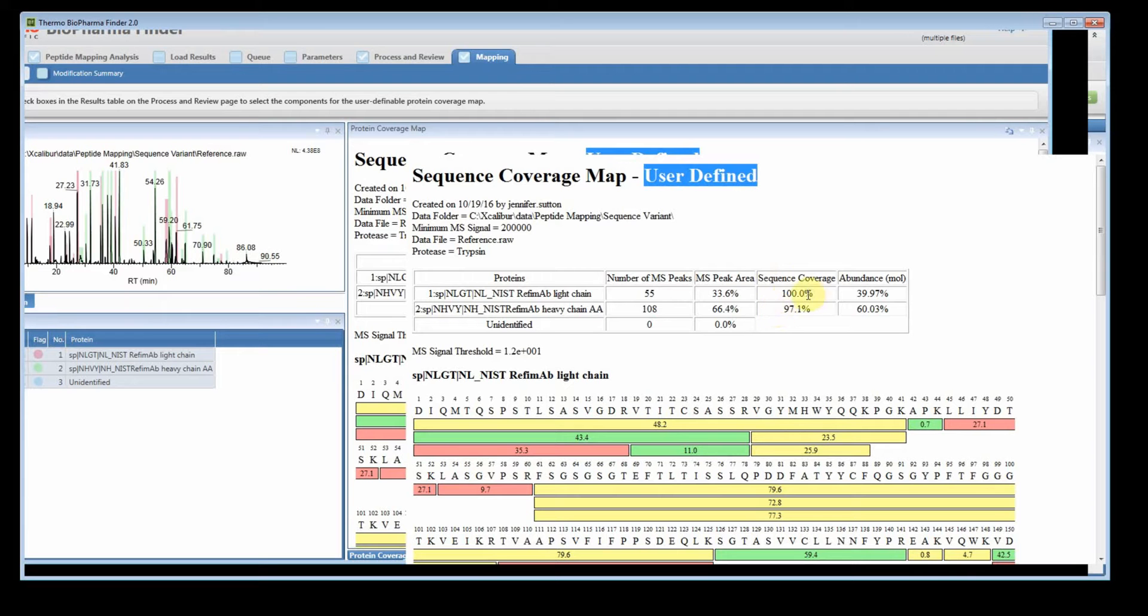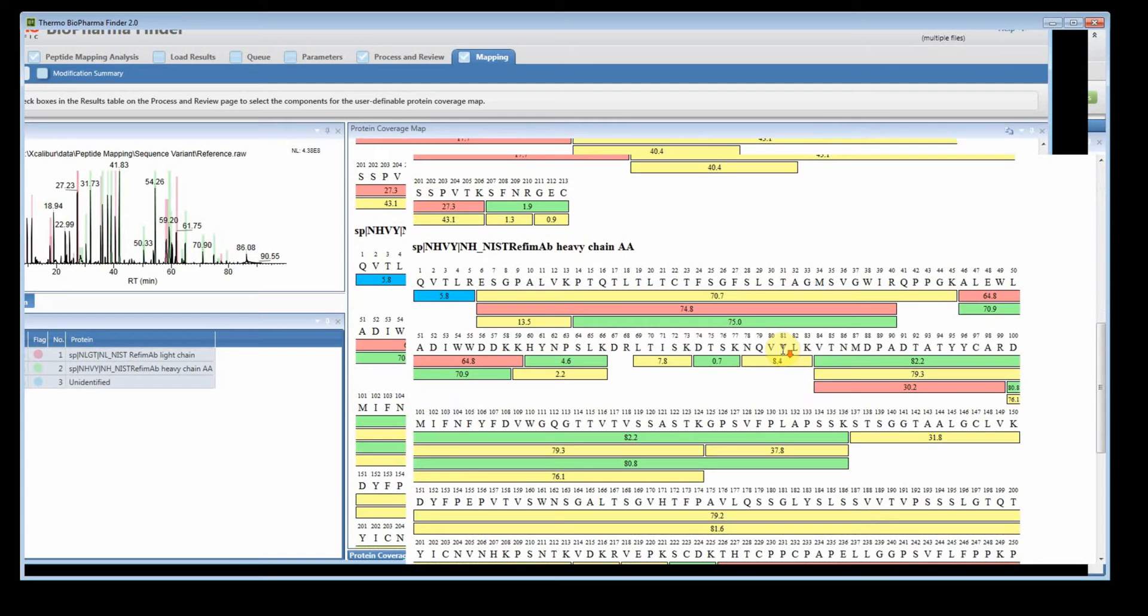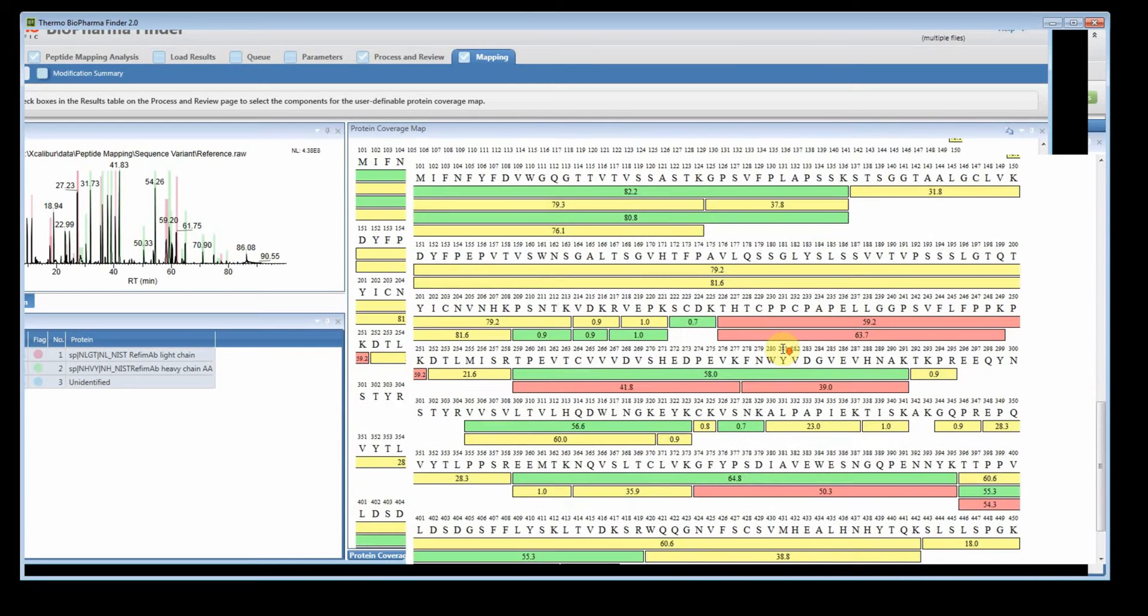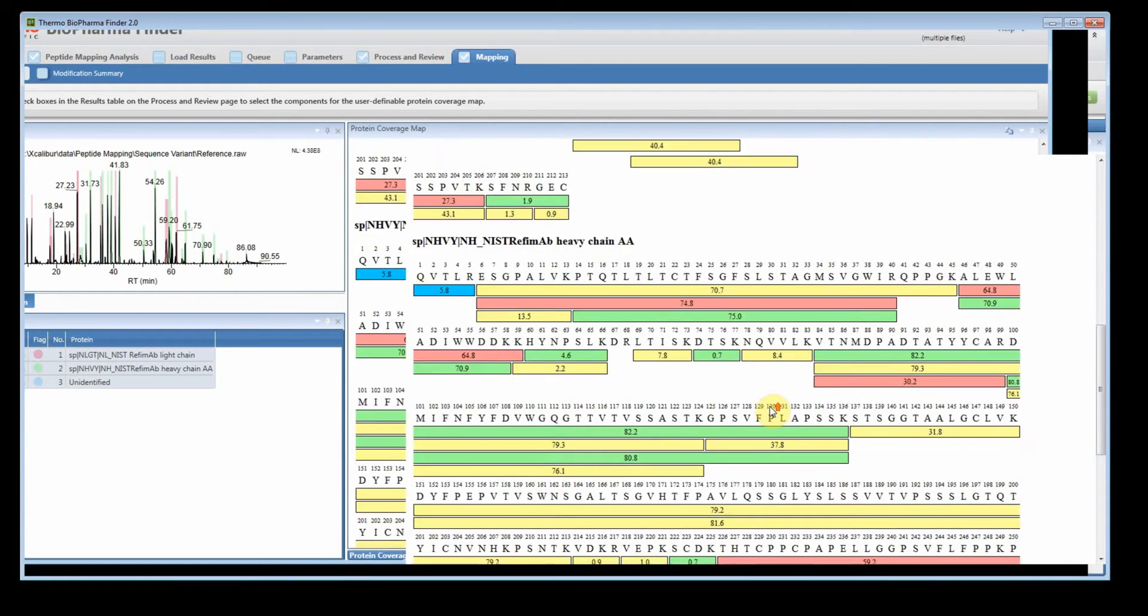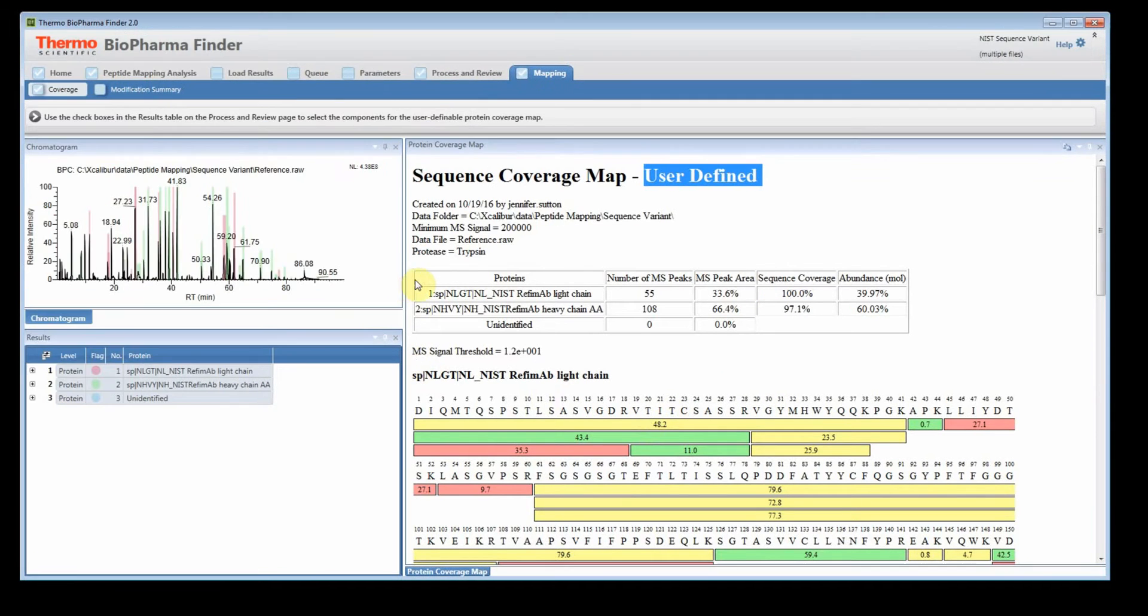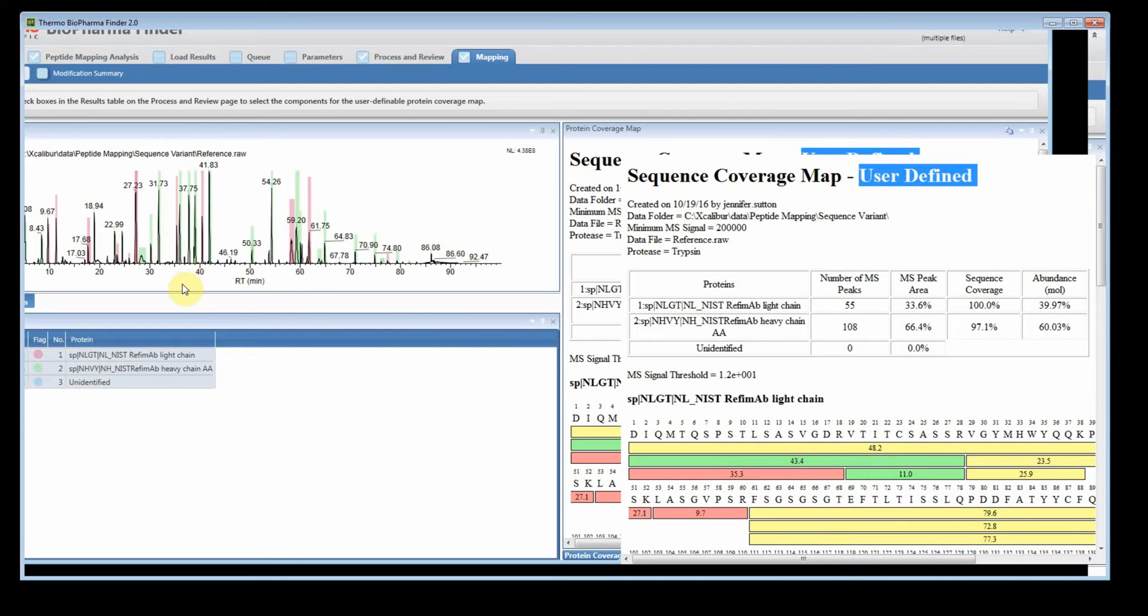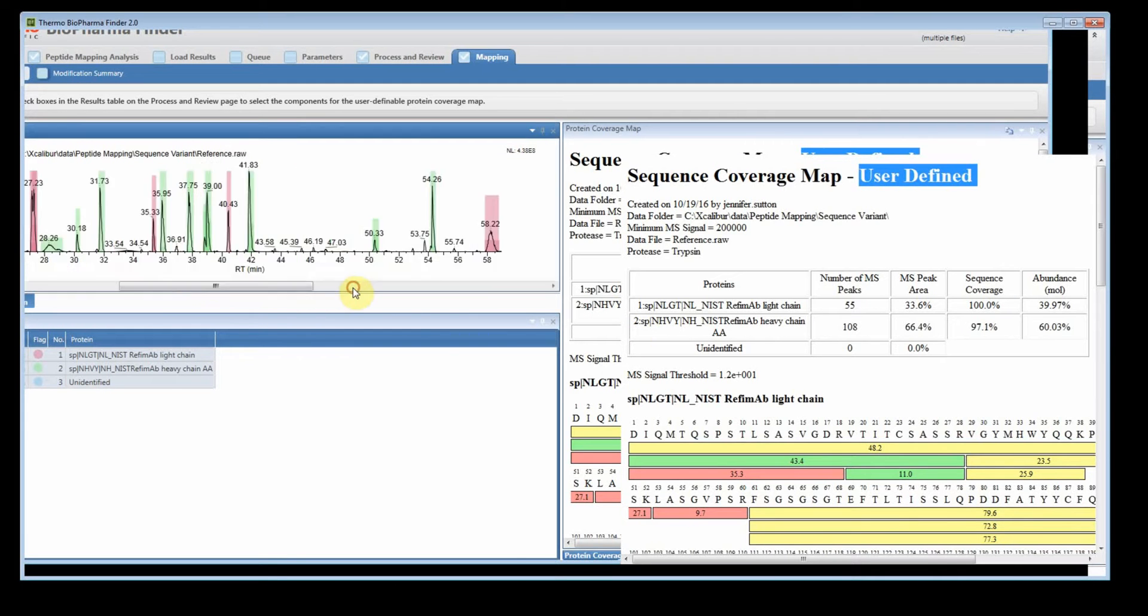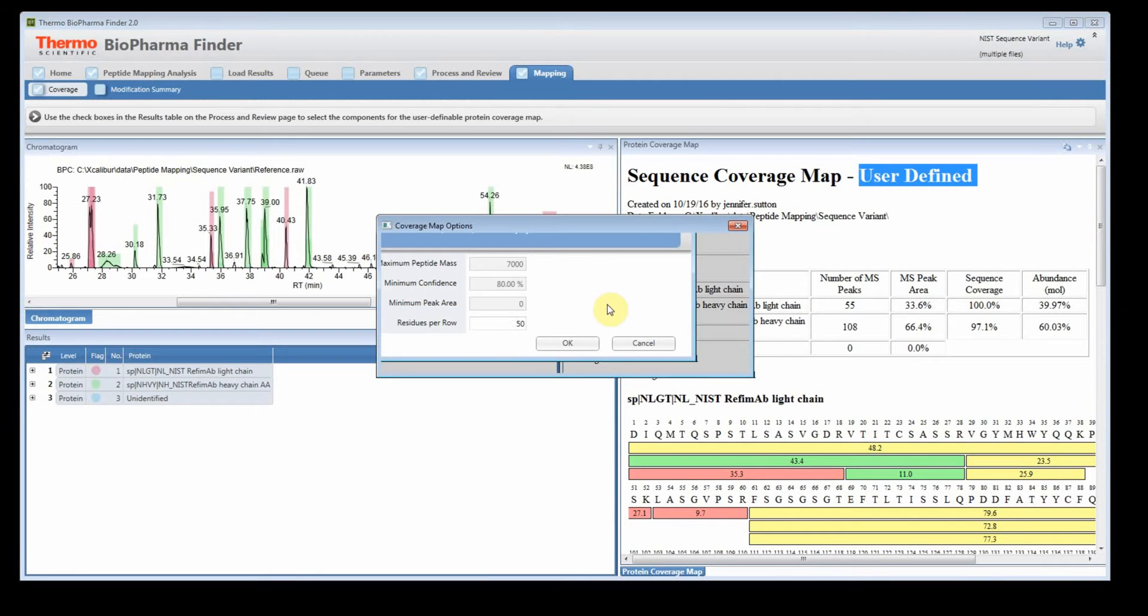So now you're going to see that we actually have 100% coverage and 97.1% coverage. You may ask, well, why did I get better coverage when I did it this way versus the default way? You are using the components that we actually checked and the shading map is also updating as well. So you'll notice on the shading map, if you zoom in, you won't see any blue. So you're only seeing the things that you actually checked.